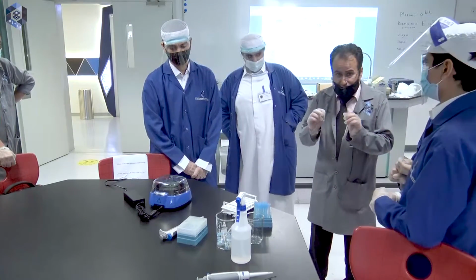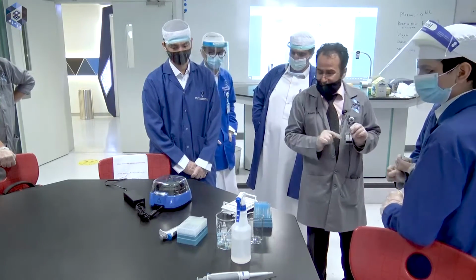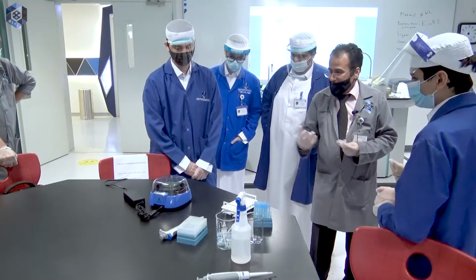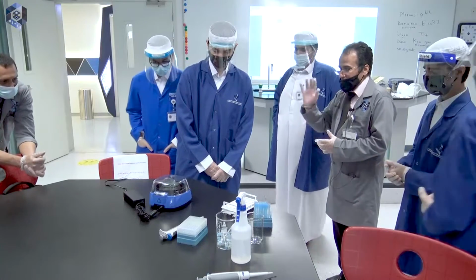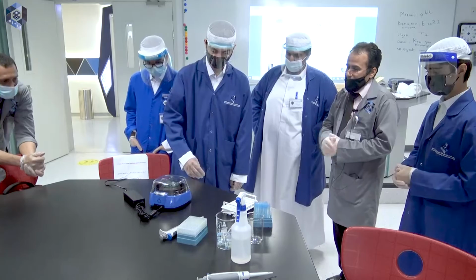Remember, if we want to mix things together, we use the vortex, the device we used last time. If we want to precipitate things, to separate them from each other according to their density, to their weight, we use the centrifuge. The heaviest things, of course, go down and settle, while the liquid part will form a layer.